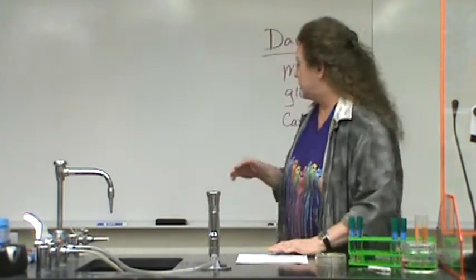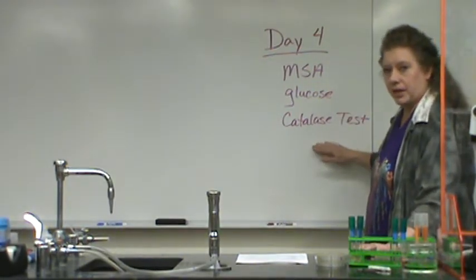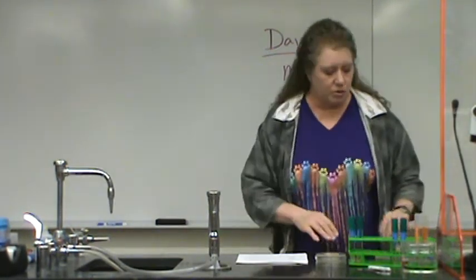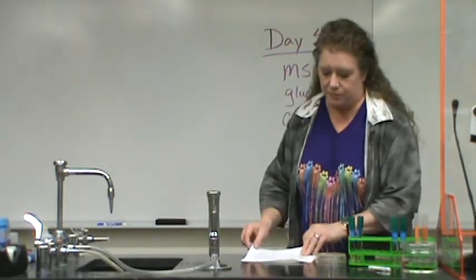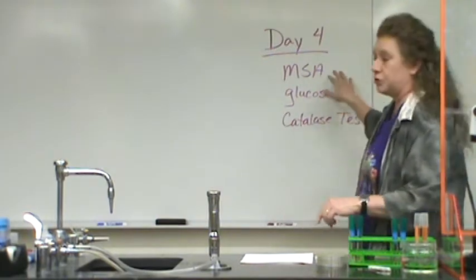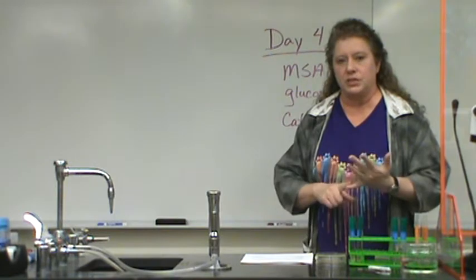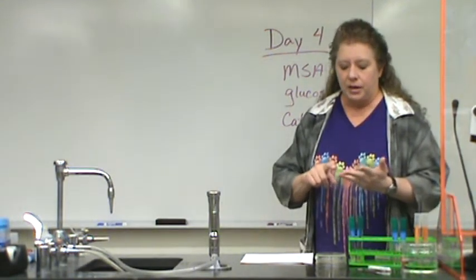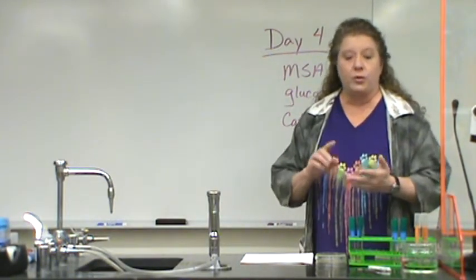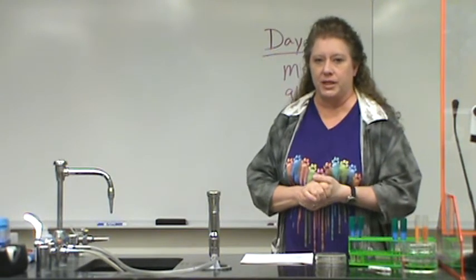we did last week. First of all, you're looking at the results on your MSA plate, your glucose broth, and your catalase test. For your MSA plate, you should know how to read an MSA plate hopefully by now. If you don't, remember to go back to your selective and differential media lab, refer to your unknown lab, or it would be really nice if you were keeping notebooks like I had told you to, and it's actually in your notebook, the table for the MSA plate.